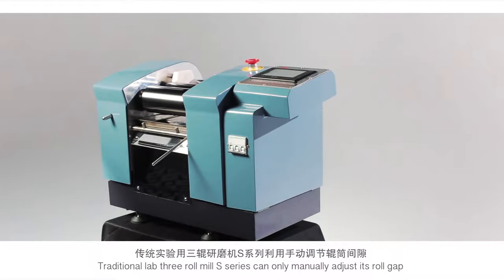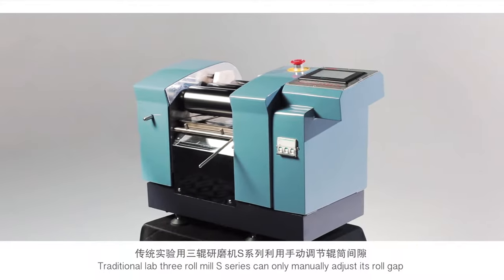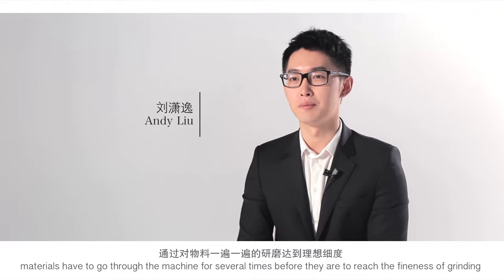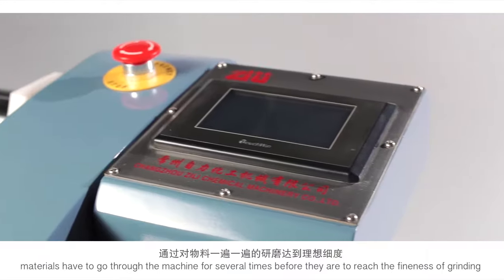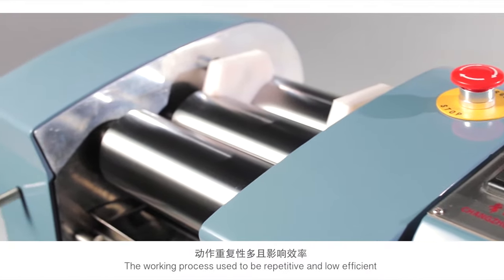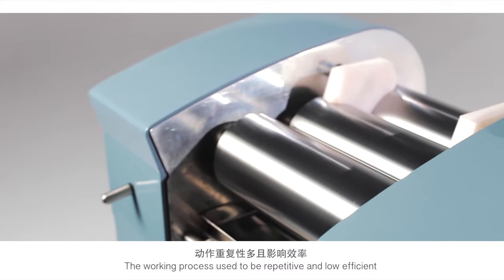The traditional lab tripro mill can only manually adjust its roll gap, so the materials have to go through the machine several times to reach the desired fineness after grinding. This makes the working process repetitive and inefficient.